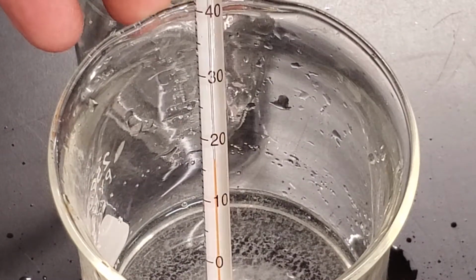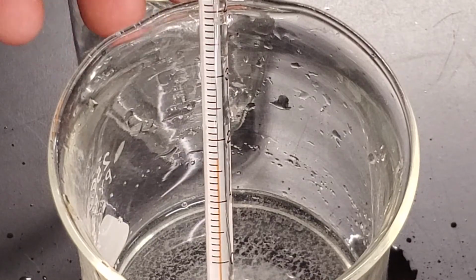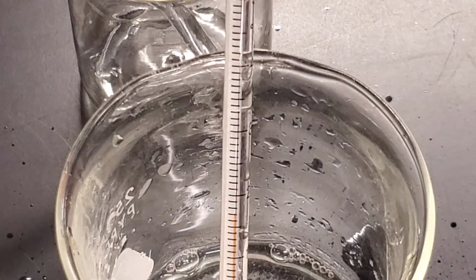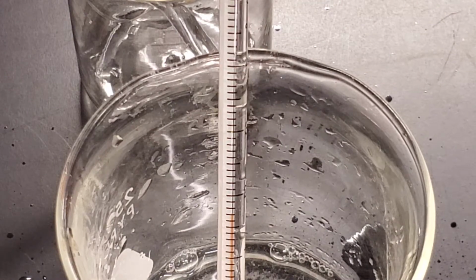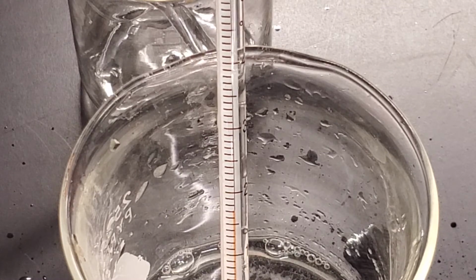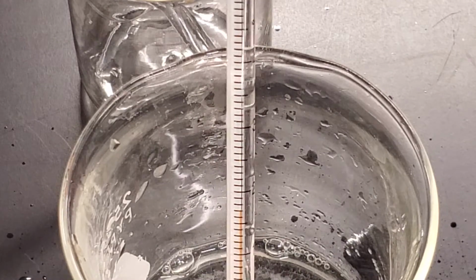We'll give it about 1 more minute to see if it moves any more. All right, so I don't think it's going to change much more. There's the 20-degree line. It looks like it is about 3 lines below that. So we'll go ahead and record that onto our table 2 under the ending.